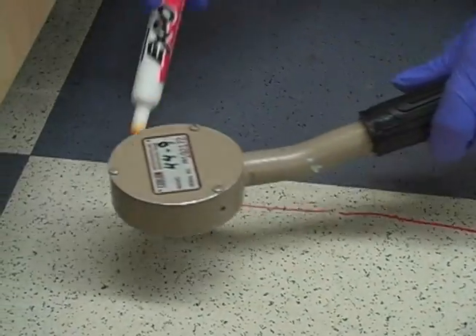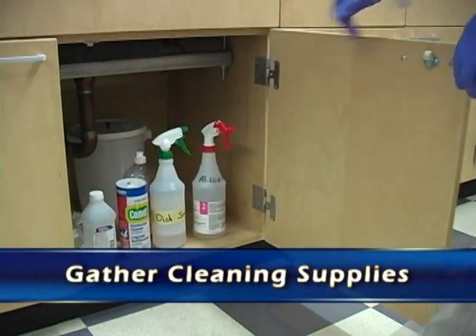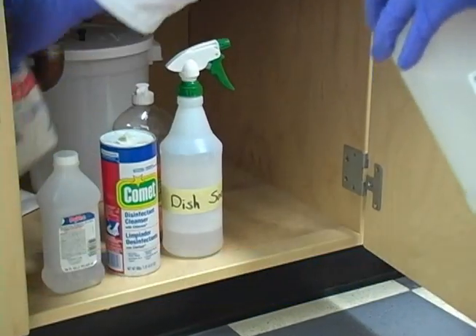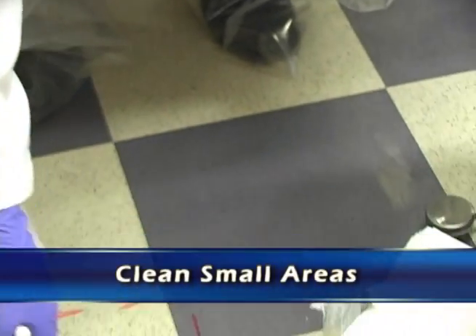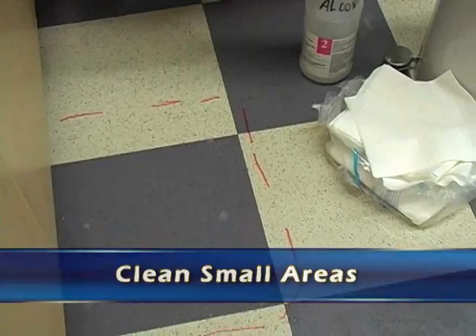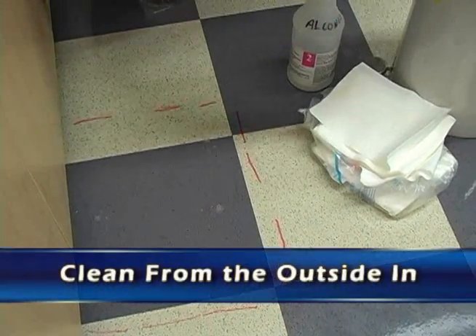We're going to clean from the outside towards the inside. We're going to gather cleaning supplies and paper towels, and a soapy solution like Alkinox. Wet the area down with it.